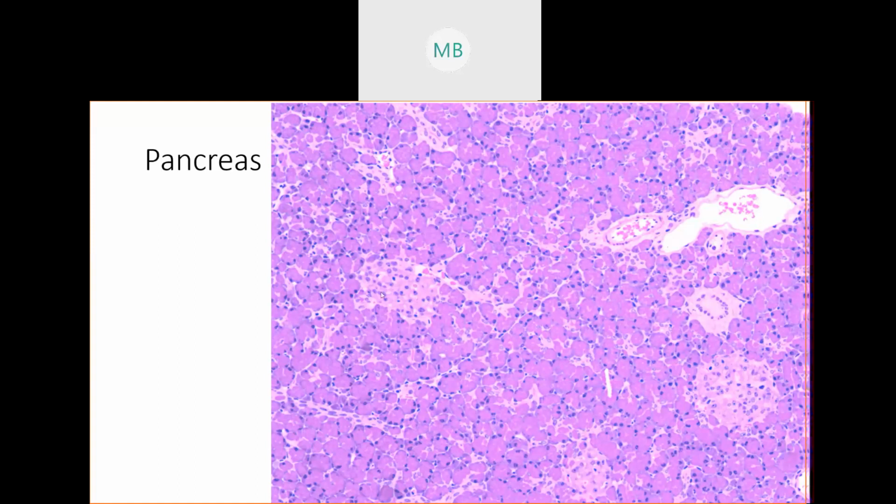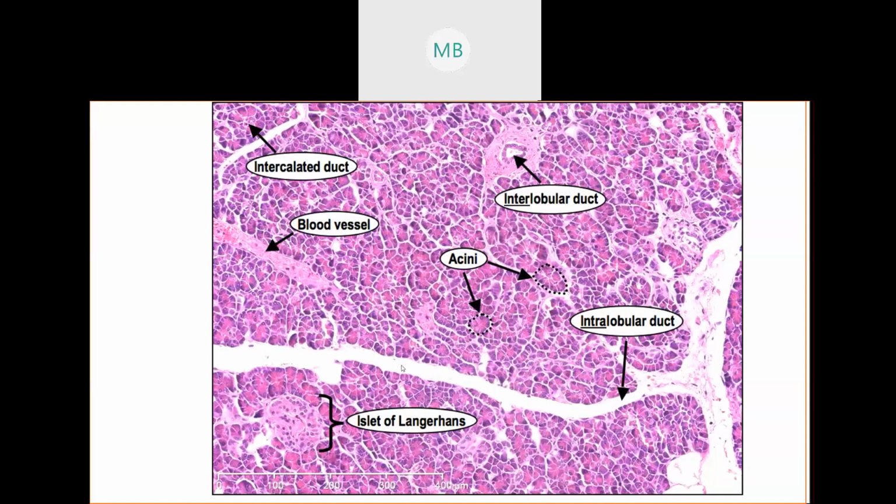So when looking at it under a microscope, it's no surprise that you can see bursts in different areas for each job, right? Your pancreas has to be well organized that way. So if we're looking at your pancreas and it's been cut long ways, you can see this ductwork. Duct, D-U-C-T. So you see this ductwork, and that ductwork is usually attached to the digestive system jobs of your pancreas, because remember, your endocrine system is ductless. So hormones are just dumped into the bloodstream. That's going to get carried away and dealt with body-wide. But your digestive system is not body-wide. It is not systemic. It is an enclosed system of itself.